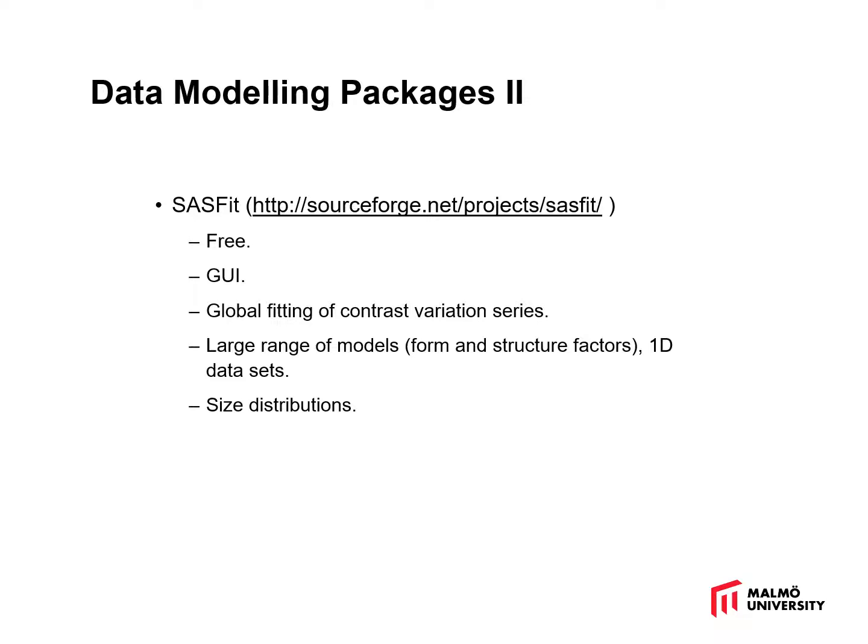And another nice and equally effective free package is SASfit. It doesn't have quite the user support as SasView. It's also free. It has a nice GUI. One of its real powerful attributes is its ability to do global fitting of contrast series. It handles a large range of models and 1D data sets, and it also handles size distributions or polydispersity.